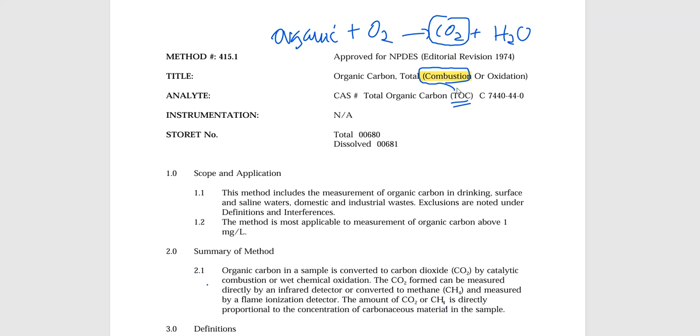So this contamination is in direct relationship to how much CO2 it can produce, because it undergoes a combustion reaction. And that CO2, if we have an eyeball in the machine that's constantly looking at everything that goes on in that instrument, absolutely it does. I've got the eyes on you.